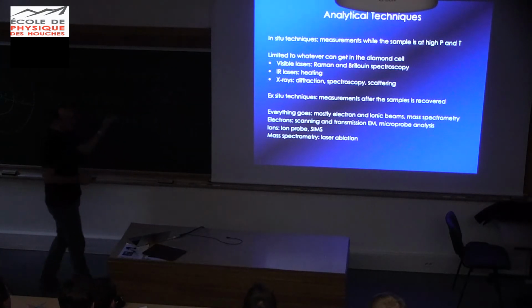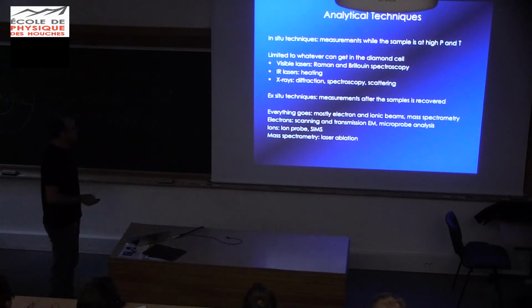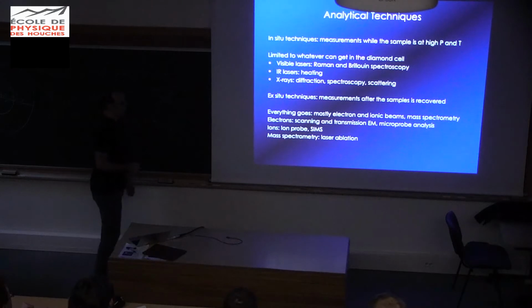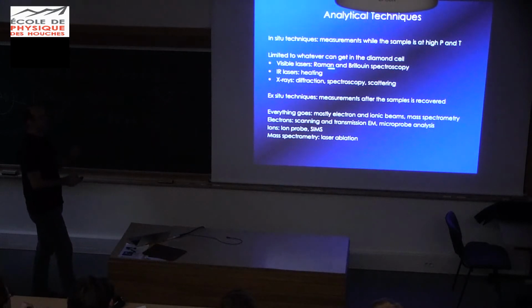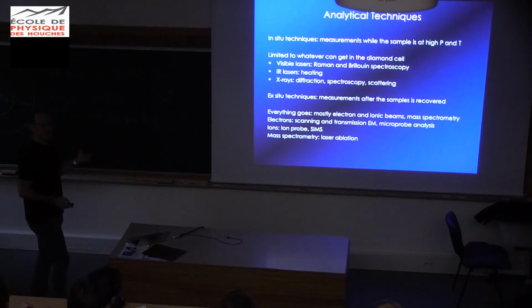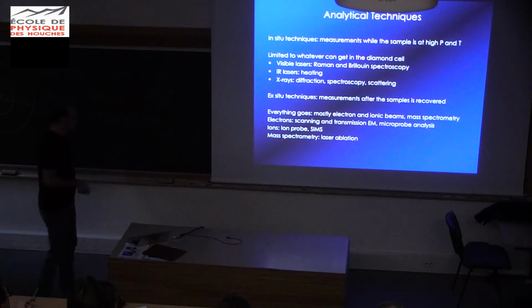Well, as we said, the diamond cell is a pretty versatile tool in terms of diamonds being pretty transparent to almost anything. So with visible lasers, you can do Raman and Brillouin spectroscopy. Infrared lasers, we already used them and you saw it for heating, but you can also use them as a pump probe technique. There are many things you can do with this. It's a booming field nowadays. X-rays and everything you can do with X-rays: diffraction, absorption spectroscopy, emission spectroscopy, inelastic scattering, Raman scattering, non-resonant scattering. I mean, a ton of things that you can do in a diamond cell in situ.